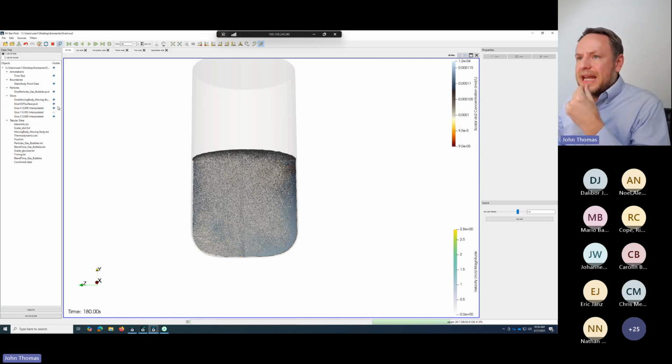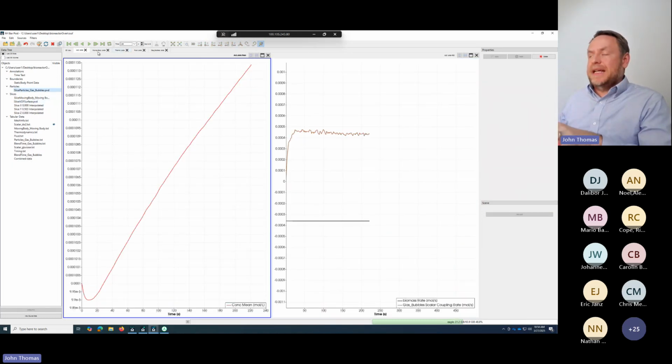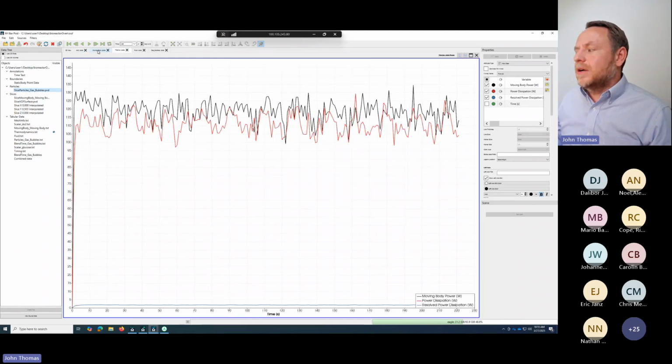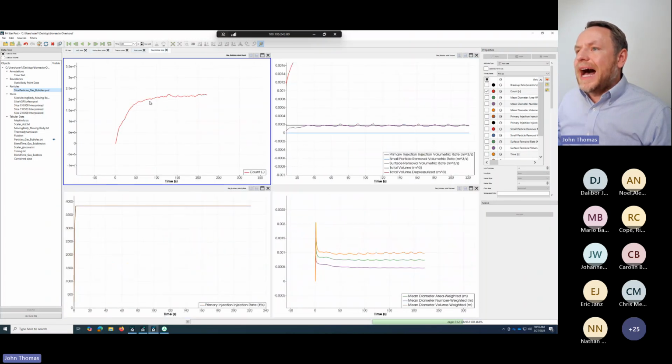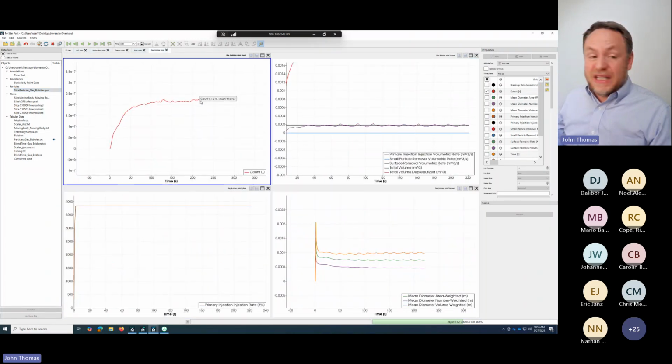And I can see, for example, there are all my bubbles. Let me turn those off because I've got a fair number of them. And I've jumped onto a desktop. This is not a big desktop. It's a Titan RTX from like 7 years ago. It's a very modest computer. But in this one here, balance looks good. Let's go over to my bubbles here. I've got about 22 million bubbles. It's beefy. If I go to my KLA, let's see what KLA I'm getting here.